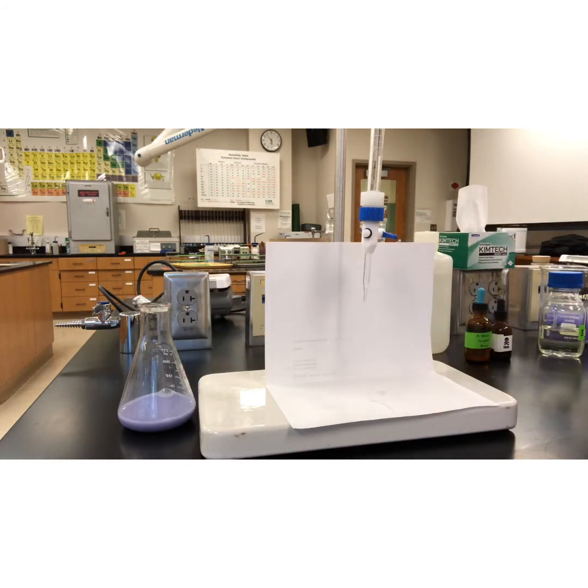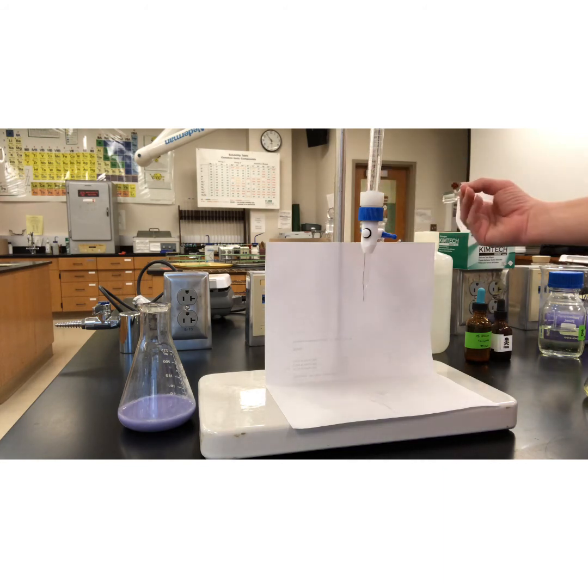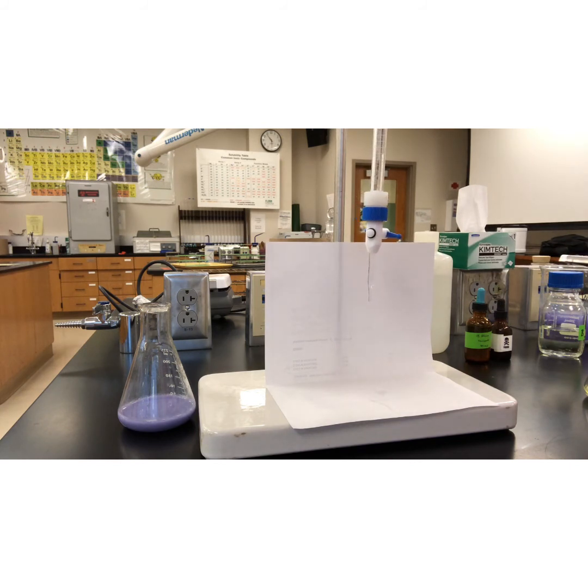All right. Ooh, it's already ready to go. Let's go ahead and top off our zinc. So let's see, without actually doing the math, that took about 18 milliliters. So we have a rough idea for our next go.